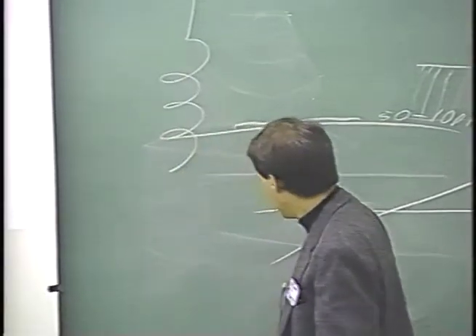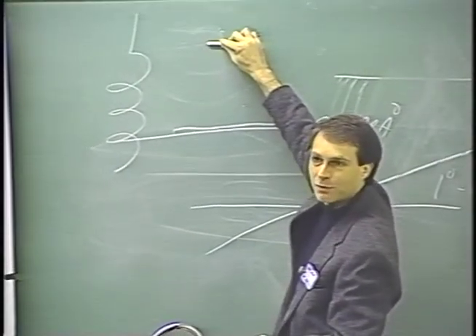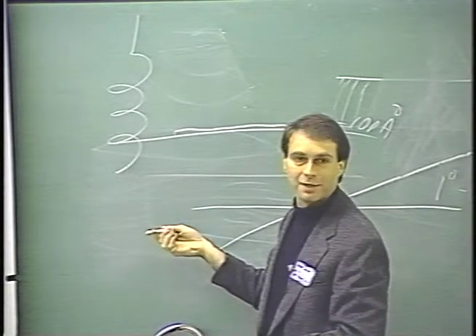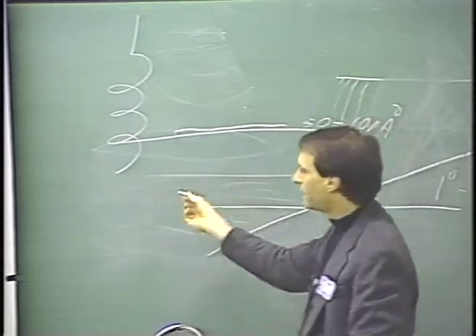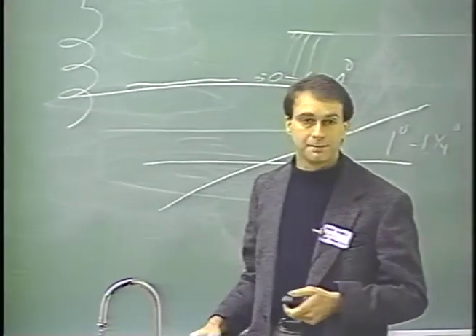So what you initially knew as the tilt axis that you were rotating your specimen holder about can be some arbitrary place on your image plane by the time you're done. And when you change the magnification, it'll go from being along this angle to being, say, along this angle, okay? And so what we have to do is determine exactly where that tilt plane is. As I say, we know the values from the encoder.